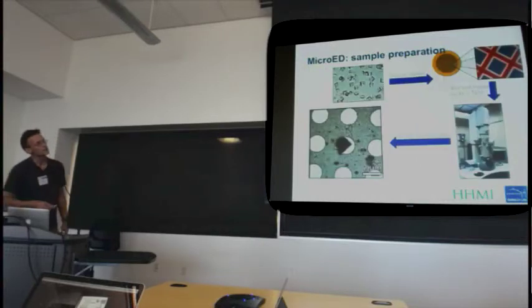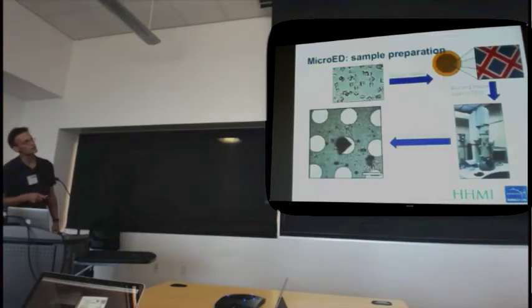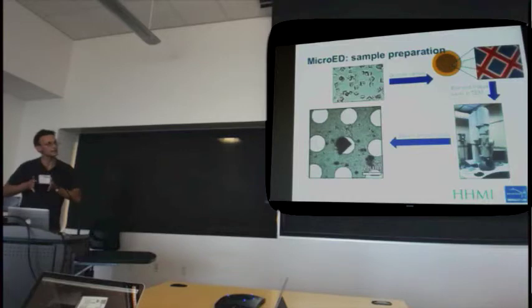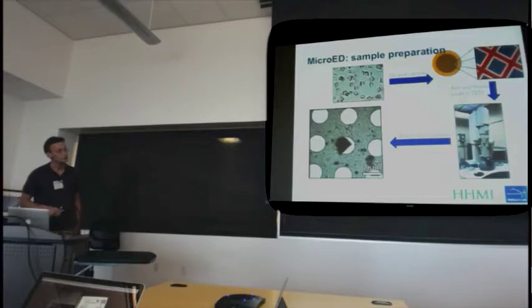In practice, the way it's done is that we have the sample, we deposit it on an EM grid used for transmission electron microscopy. This is about 3 millimeters in diameter. We put that grid, after freezing and blotting it, into an electron microscope and screen for crystals, which look like that, and then expose them just as we would have done in the X-ray case.